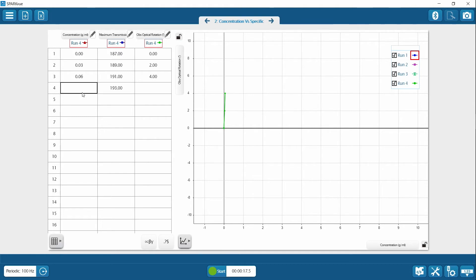Okay, this is a 10% solution of 10 grams per 100 mils, and that means it's 0.1. The difference here is six degrees of rotation to get that to line up, and you'll see that my graph is growing. You may think, oh, that's all squinched together.